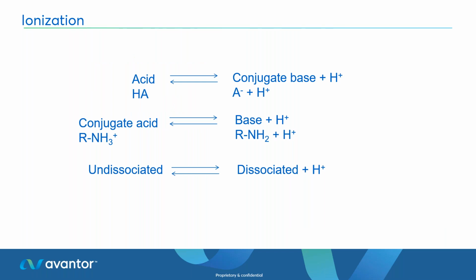If we go back to our chemistry days at school, you think about ionization and this sort of acid base. We're working with reverse phase, and the best state for an analyte to be in reverse phase is its most hydrophobic phase, which means that if it's ionized, if it's positively or negatively charged, we're not going to get good retention. We're not going to get good interaction with our hydrophobic C18 column.